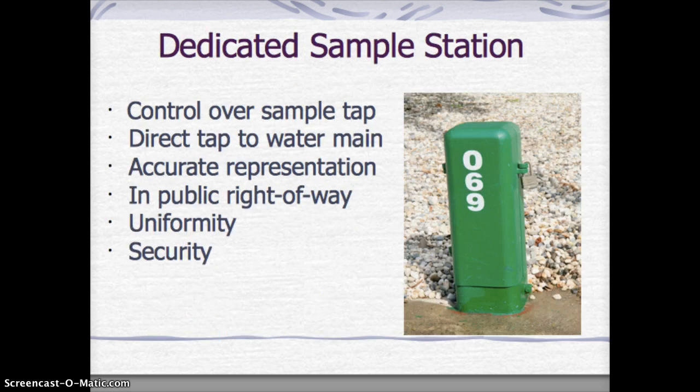Now, this is a picture of a dedicated sample station in Santa Rosa. You may have seen one like that on your travels, and you might have wondered what they are. Well, they are a dedicated system.